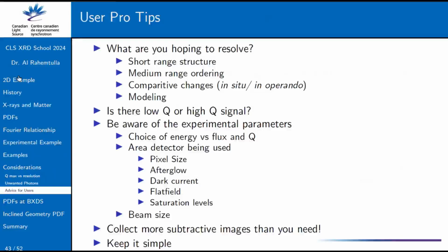A lot of medical X-ray area detectors, which are very popular at synchrotrons because they're thin and relatively cheap, are very handy. But if you blast something with really high intensity, some of those signals can still linger for a bit before they die out. That's very helpful to know about, especially when it comes to taking background measurements. The last thing you want to do is superimpose something else.